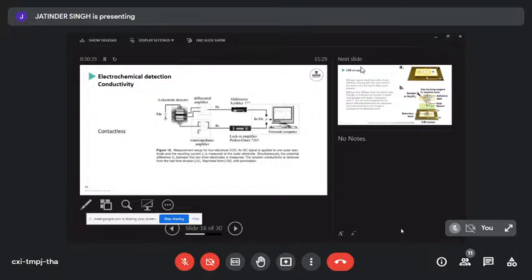But yeah, if you're interested to do anything microfluidic, have a little bit of a look at what the budget microfabrication approaches are that are available. Because there's actually a lot that's possible without having a clean room facility.